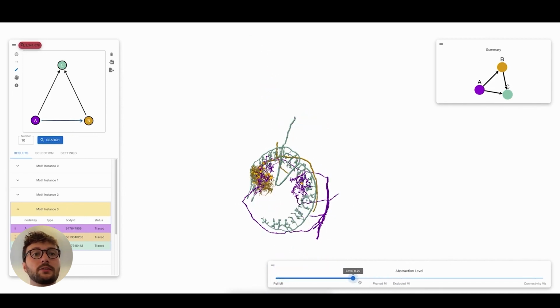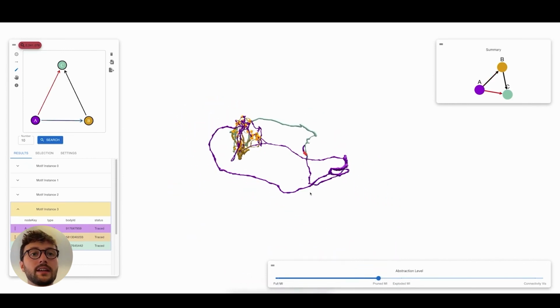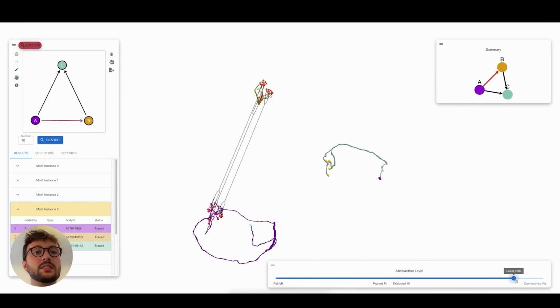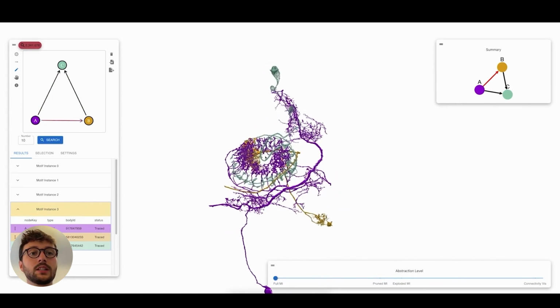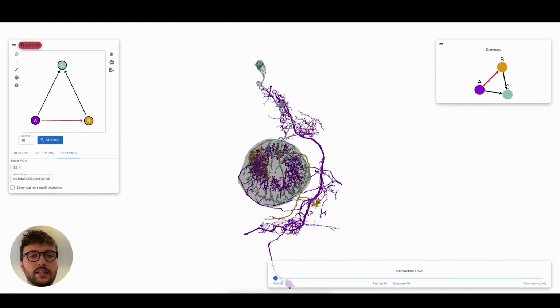Our approach consists of 3 main steps. First, users can slowly prune all neuron branches that are unrelated to the motif, highlighting the core motif connectivity. Second, by dragging the slider further, Vimo untangles the neurons by transitioning to an exploded view. This allows users to inspect complicated neuron morphology with less occlusion. Third, we hierarchically cluster and bundle connections between neurons to highlight synapse clusters. Additionally, Vimo allows graying out unrelated neuron branches and highlighting brain regions to provide spatial context for neuroscientists.